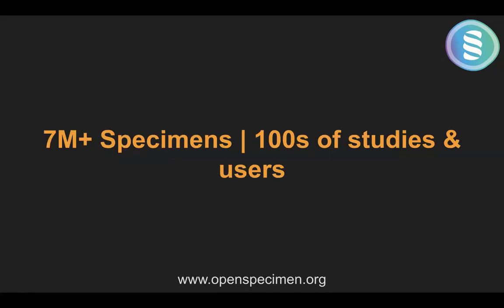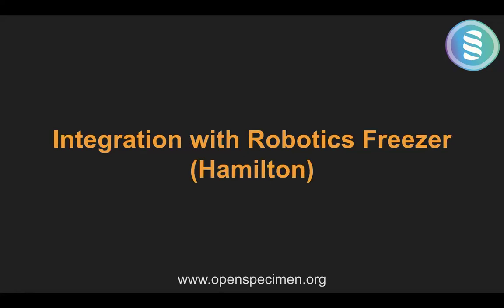As I said, the numbers are huge. They had about 7 million plus specimens across 500 or so clinical trials and hundreds of users across the three sites that I mentioned. It also involved integration with robotic freezers, and they also used our APIs to do additional integrations internally.